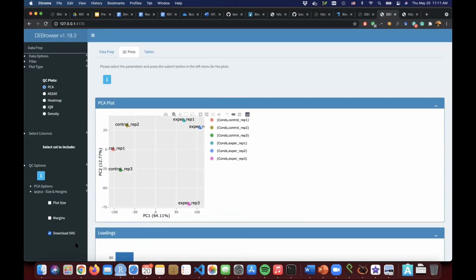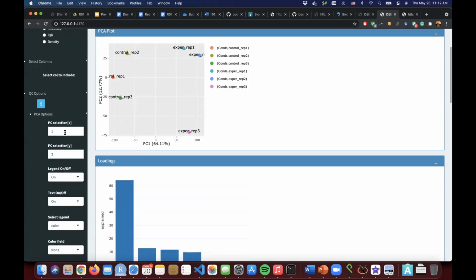These are scalable vector graphics that you can play with in other software, because some of the naming, even though the text is here, doesn't look good, because R is automatically putting the location, and it's hard to change them here. That's why you need to play with these plots a little bit using other graphical interfaces.